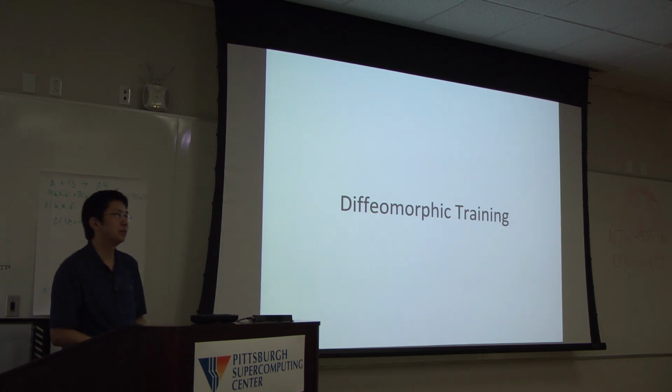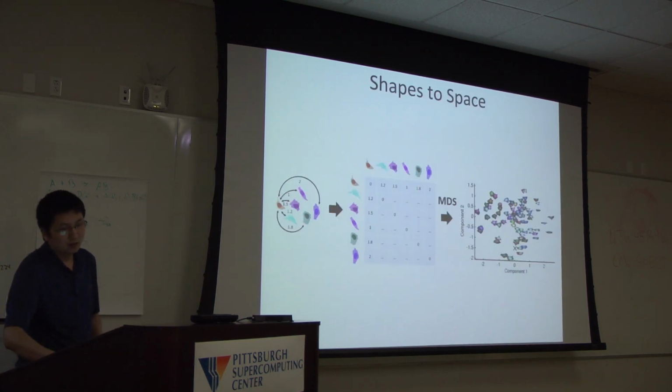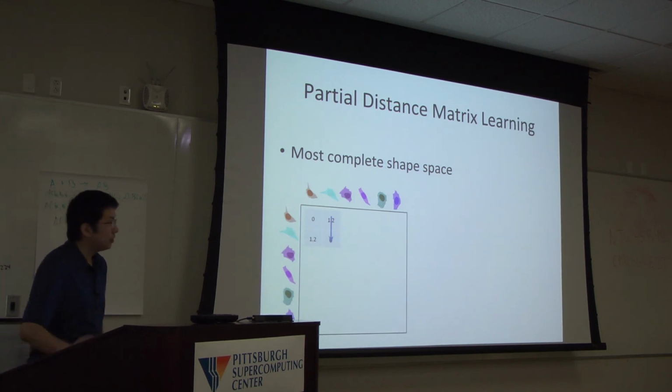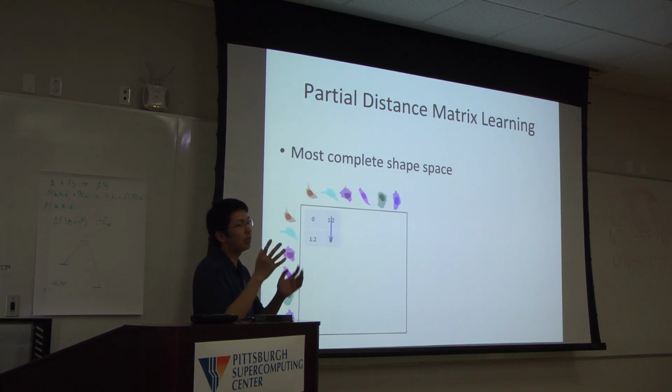How many stacks do you use then? Actually, as I said, this is a non-parametric model, so it does not assume a specific number of stacks for the shapes. We can input arbitrary shapes. Maybe some cells have 2 stacks or some have 3 stacks.